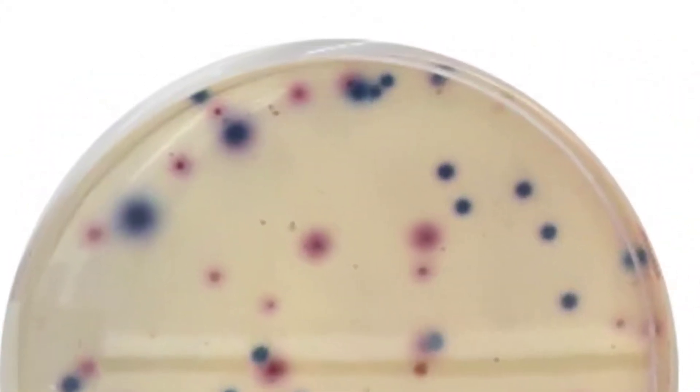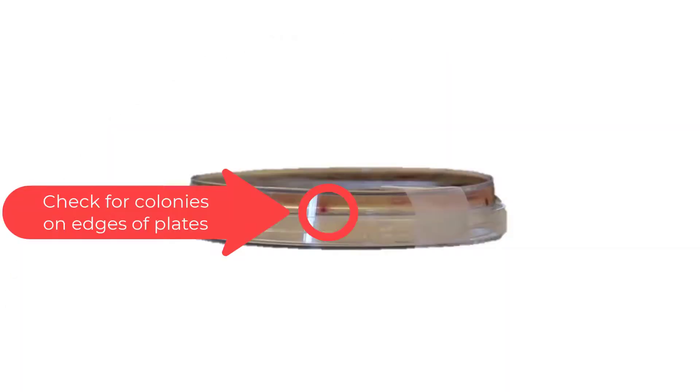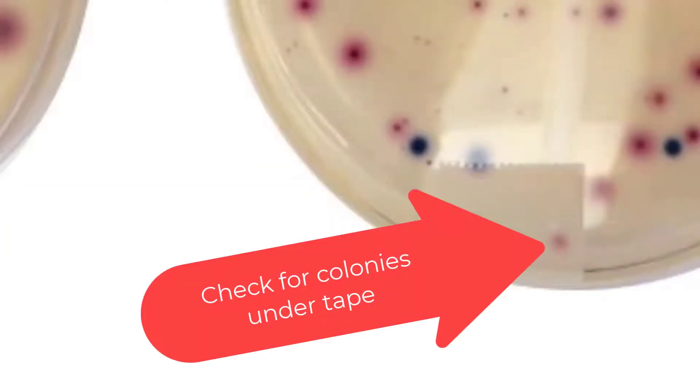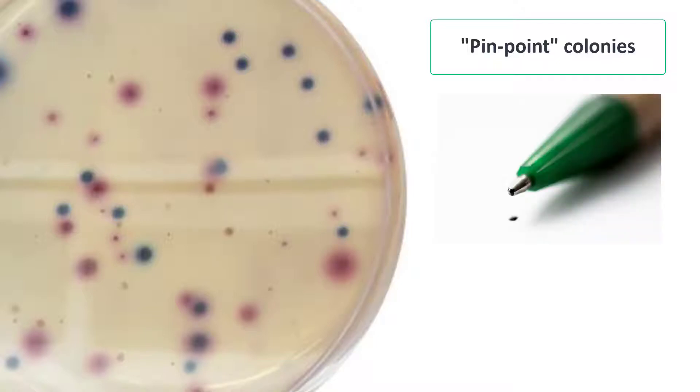Check for colonies on the edges of the plate — it may look like the colony was cut in half, but if you look at the plate from the side, you can see that it is a whole colony. Also check for colonies that could be hiding underneath the tape that we used for incubating. Do not count very small or pinpoint colonies. For a colony to be large enough to count, it should be no smaller than the head of a ballpoint pen or at least as large as a period typed in a 12-point font.